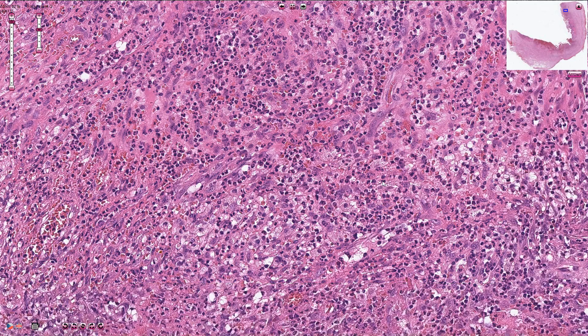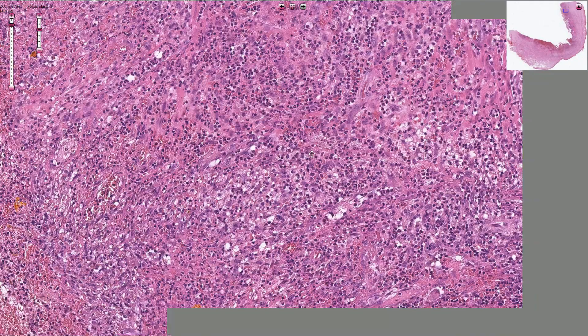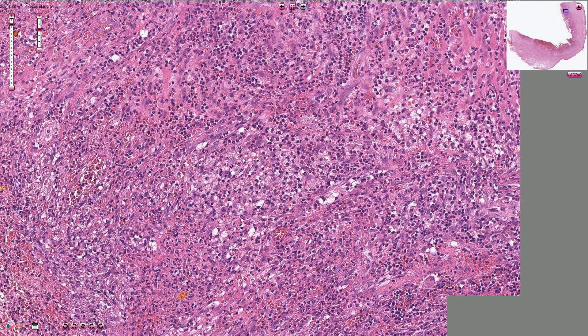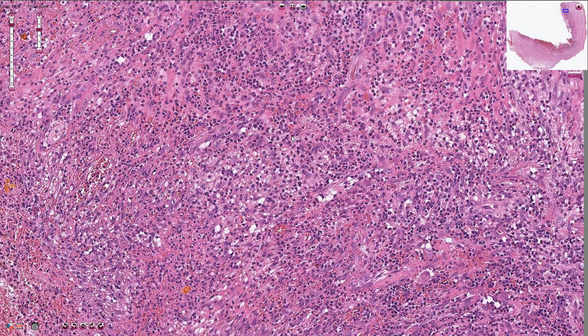The acute inflammation can be quite mild or quite prominent, as in this case, and we would call this purulent cholecystitis.